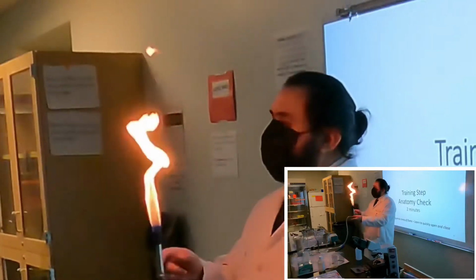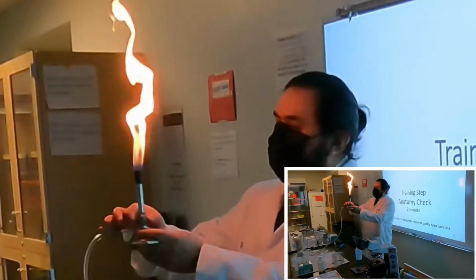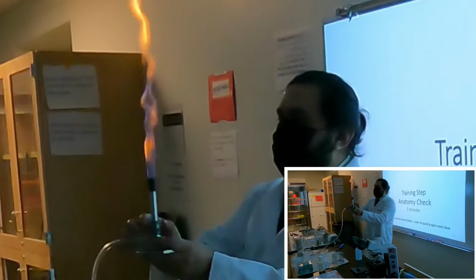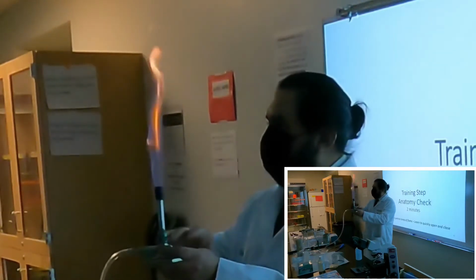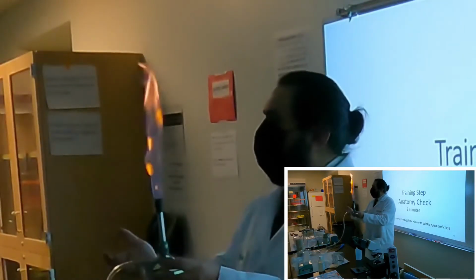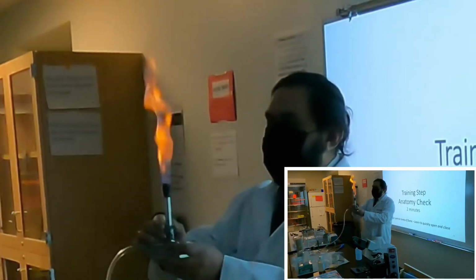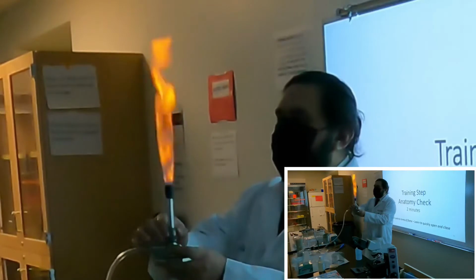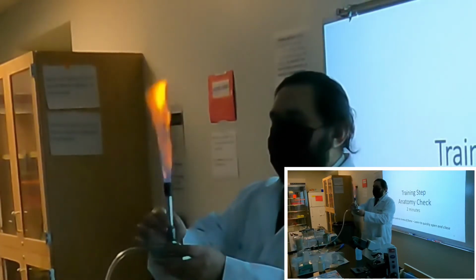What we're going to want to do is open the barrel by turning it, in this case, counterclockwise, until we get a blue flame. That's a much hotter flame. It's about twice as hot as the orange one. This is the one we're going to use for the cans to boil our water and things like that. Eventually, we're going to go through the third stage where we continue to open this. I want you to also listen. You're going to be able to hear once it turns into the ultimate one. I'm going to open this quite a bit.